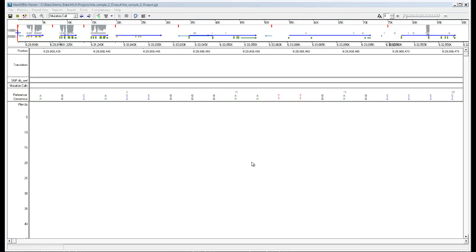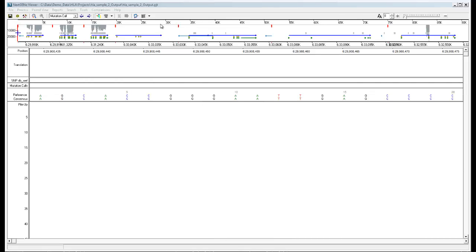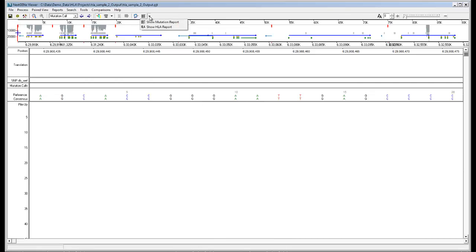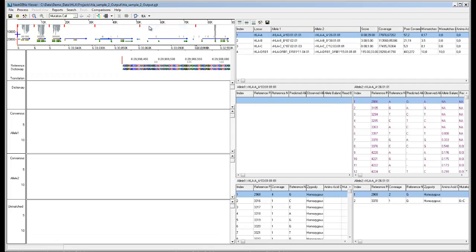Once the analysis has been completed, when the HLA project is reviewed in the viewer, you can click on the report selection toggle button to select show HLA report. This will switch from the default view to the HLA report and visualization.